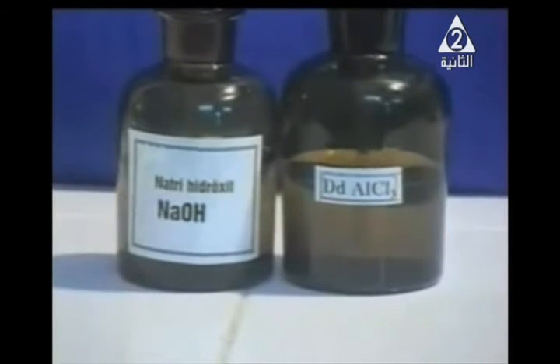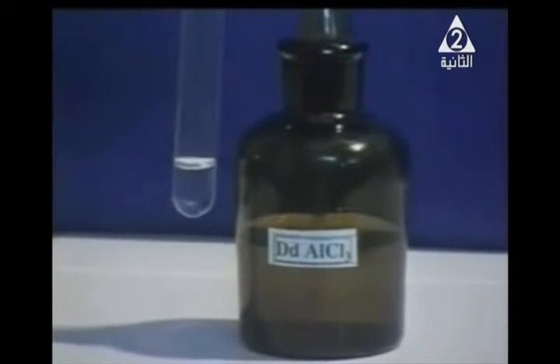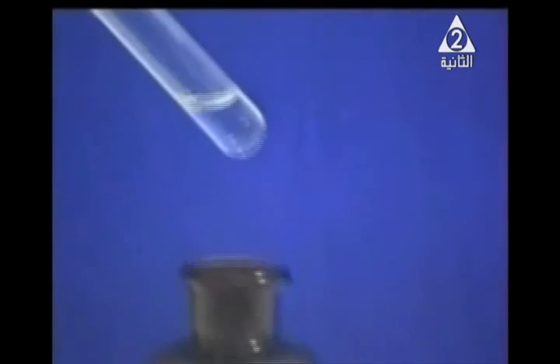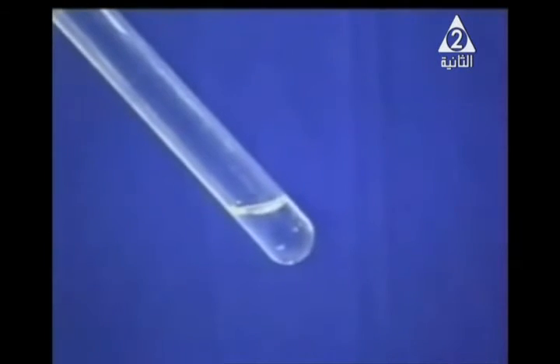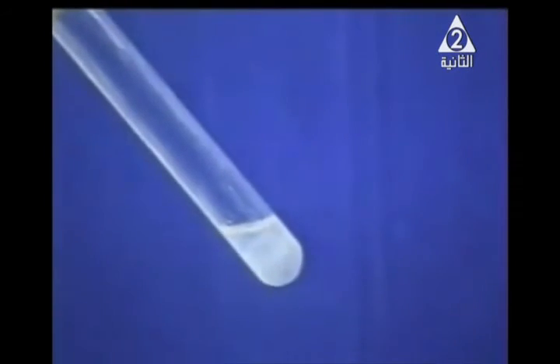Now, my dear students, we use aluminum chloride salt as a solution of aluminum ion cation, and we are going to add sodium hydroxide solution over it. If the reaction continues, it gives white precipitate of aluminum hydroxide.